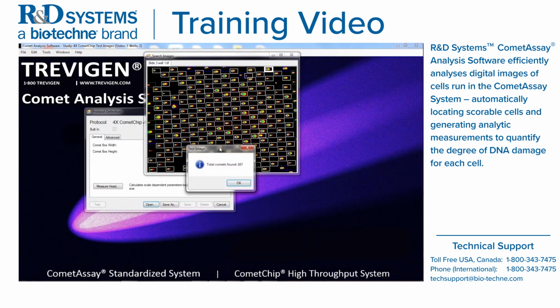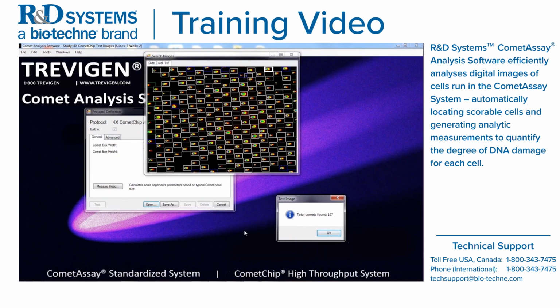You can see that it was able to identify 167 comets using this default protocol. And what you're looking for is the white box being drawn around the comet. You need to know how many comets it could find with the protocol. And you don't want things being obviously left out.